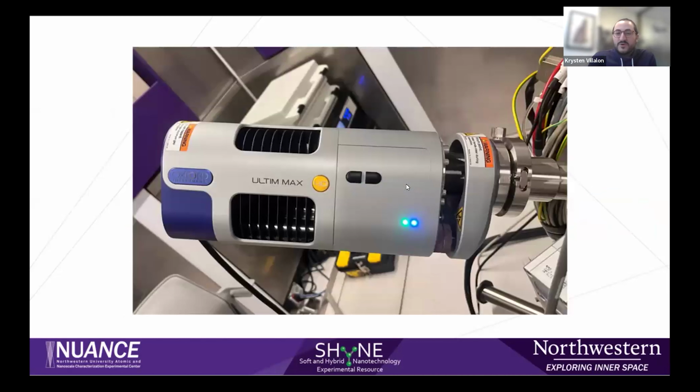So here's an example of one of our EDS detectors showing that it's currently cool. So you can see the blue light on the side here is indicating that the crystal is cool. And you can see the fins toward the back of the body as well.